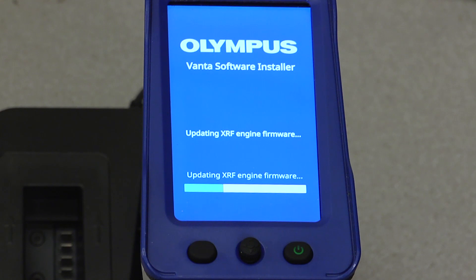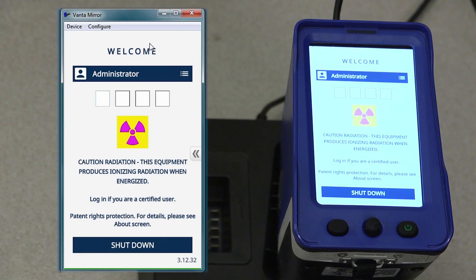Depending on the software update, your instrument may also need a firmware update. The latest version of software will have any necessary software updates as well as any firmware updates, and these will install ensuring that your instrument is as up-to-date as possible. After the USB installation is complete, the login screen will display. At the bottom right-hand corner of the login screen, the latest software version will display.